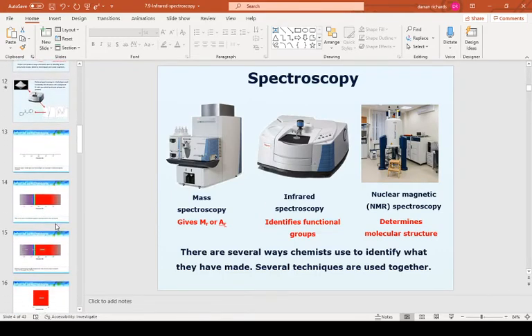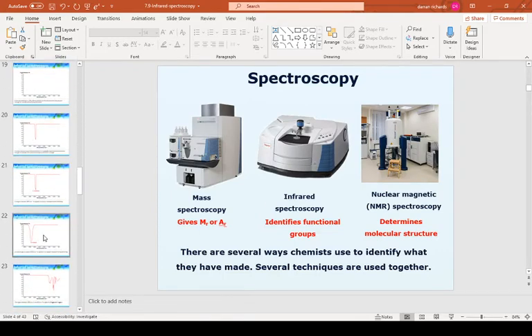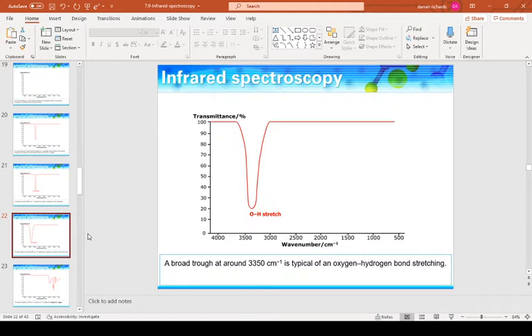So what you need to do is test them, and this is where infrared spectroscopy comes in. Now, if we look at infrared spectroscopy, the technique itself you don't really need to be an expert on, you just need to be thinking about, well, actually, they send out a load of infrared waves. Every now and again it hits the molecule, and when it hits a certain wave number, the energy is absorbed, and you get something like an OH stretch. So if there was a molecule with an OH in there, such as water, such as an alcohol, you get this OH absorption, and that's what you see.